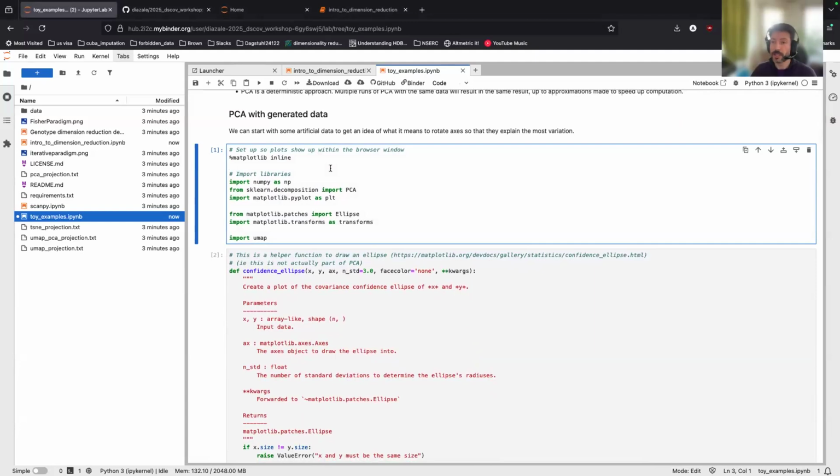That's a great question. One of the strengths of a method like UMAP, which I use all the time, is that you can take the top 10 PCs, run them through UMAP, and it's kind of like getting a summary of the top 10 PCs on a 2D plot. If you're looking at multiple principal components, don't just look at one versus two. Do some pairwise plots, like one versus three, one versus four, two versus five, at least for the top three or four PCs.